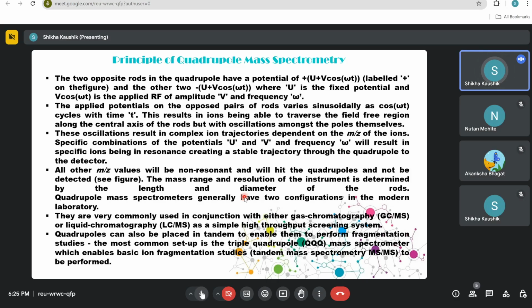That's why it becomes a little easy, because then you will be reading some specific protein. So you are aware whether your samples are prepared in a good manner or not. If you're not getting the details of your desired protein, you may get the information that things might not have worked well during your sample preparation.